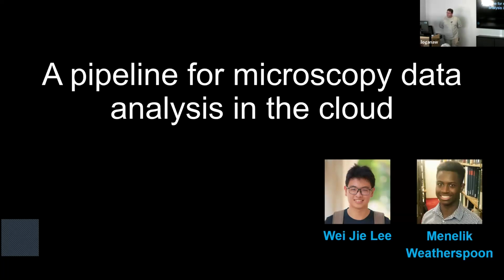So the spectrum that each camera captures hypothetically is all customizable, and the script you guys are running on the cluster will handle that? Well, the thing you're picturing is probably like if you've used a confocal where you have a selection of spectral range, that is accomplished by using a prism and splitting everything out, and then selecting a region of that spectra to collect back.